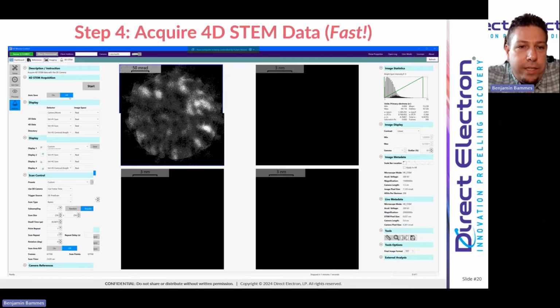So this is a Celeritas XS experiment. We are acquiring a 256 by 256 scan of strontium titanate with 38 microsecond dwell time. And you can see that we're doing this repeatedly. We're scanning the same specimen area over and over again. I'll play this one more time.